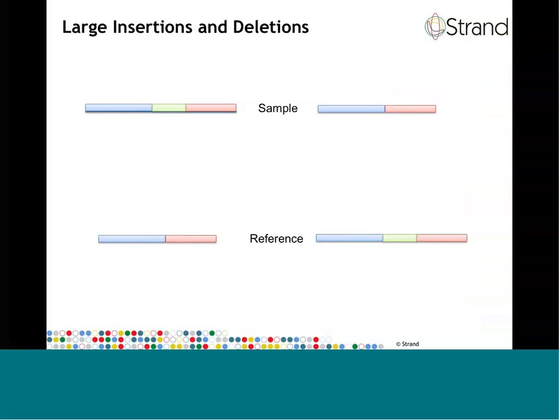So the SNP detection workflow steps, as shown in the previous slide, allow for the detection of relatively small insertions and deletions, typically on the order of a couple of tens of bases. But larger insertions and deletions can be detected as well with Avadis NGS when using paired end or mate paired data, as shall be demonstrated by the examples here.